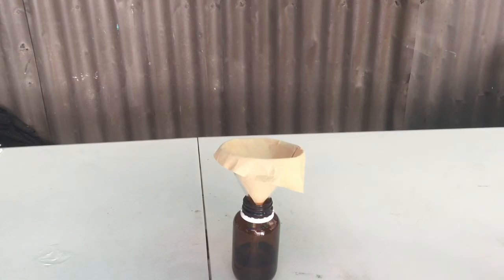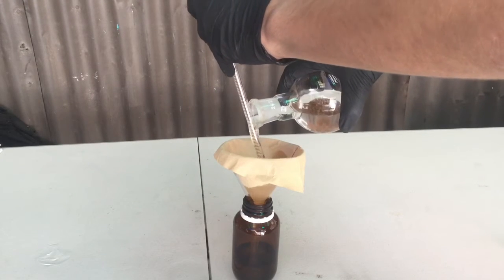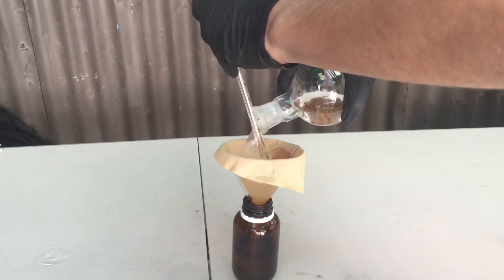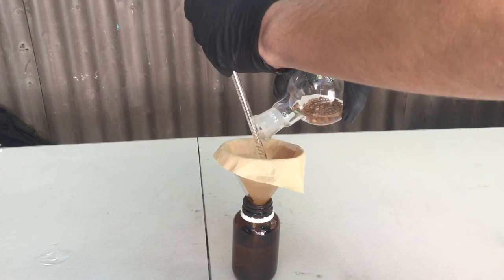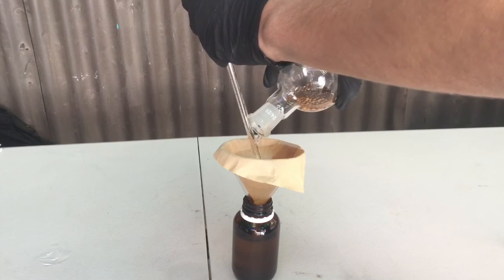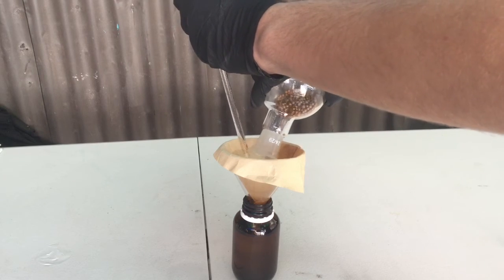The final DCM product was then filtered into a dark bottle. The DCM should be stored in a very cool location or in the fridge as it's very volatile. I kept mine in the fridge.